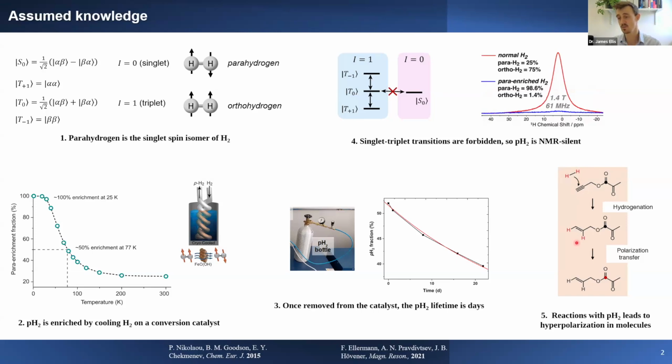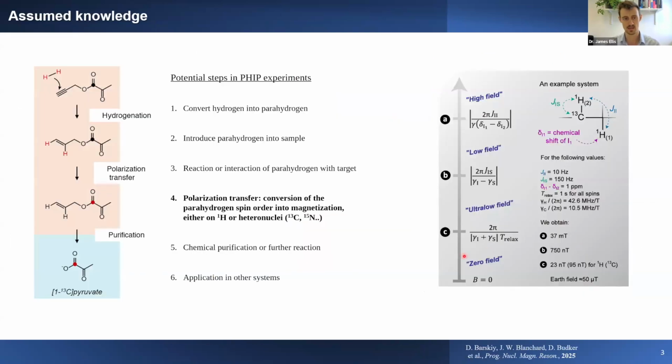And this is essentially a hyperpolarized state. And after hydrogenating molecules, we are interested in things like polarization transfer to other nuclei, or measuring the hyperpolarized hydrogens themselves.